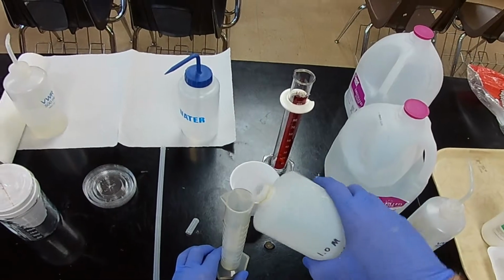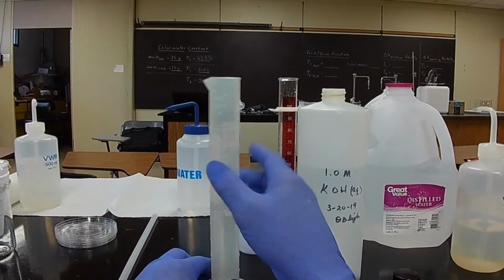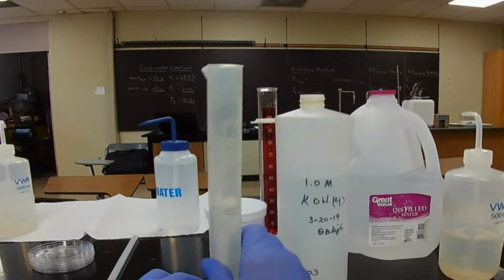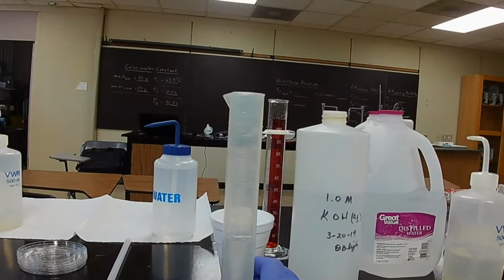See how close I can get. Get rid of the bubbles so I can actually read the liquid. All right, I got just a hair too much.